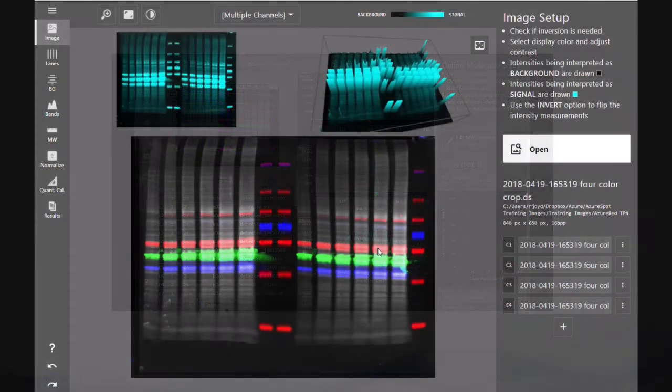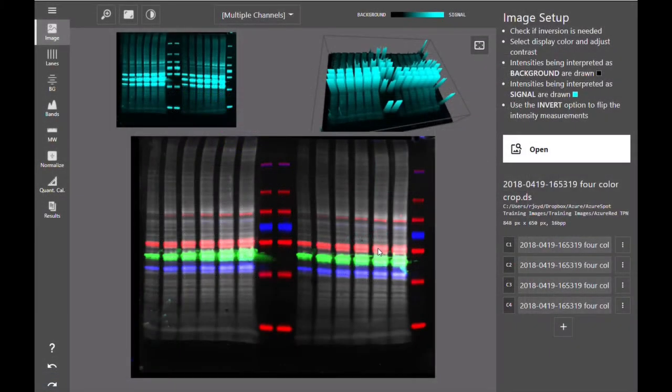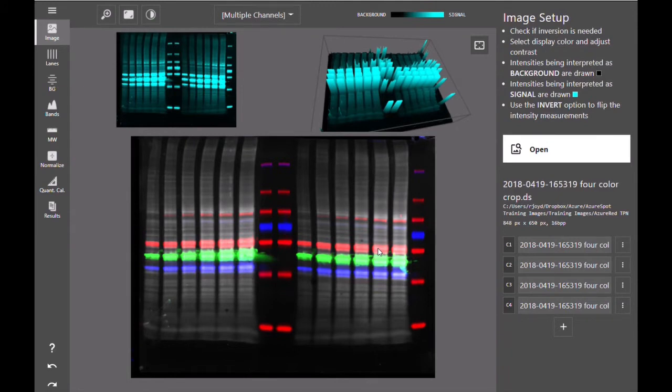To cover normalization and quantity calibration we'll be using the same western blot that we did in the previous basic multiplex workflow video.